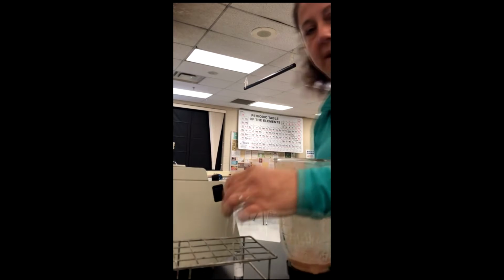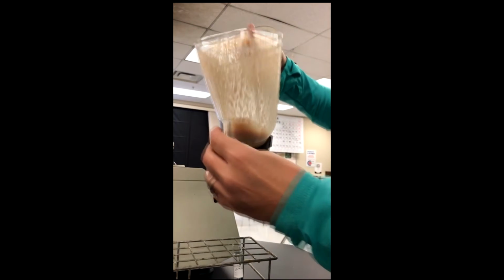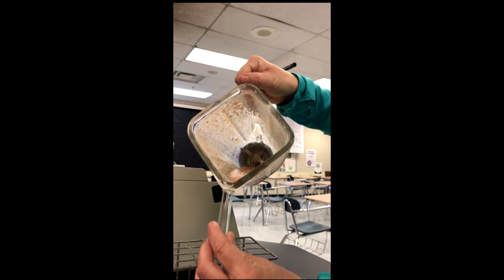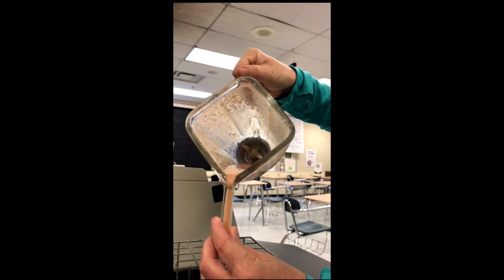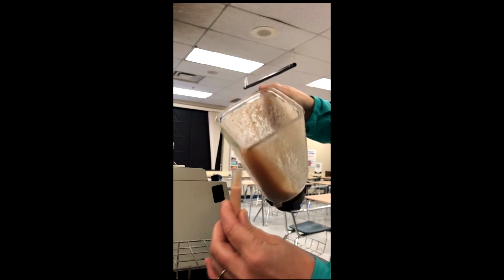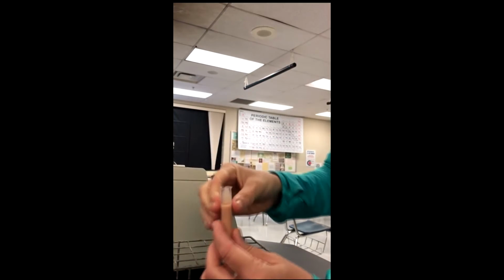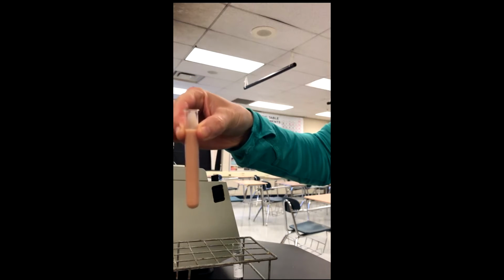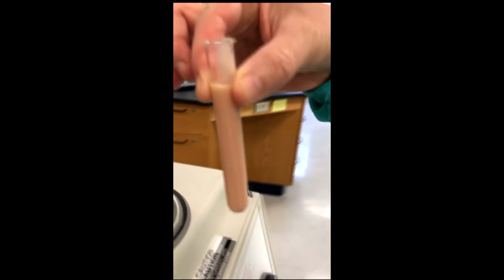I liquefied that hot dog for about 5 minutes in the blender. And so now I'm going to pour my hot dog slurry into a test tube, like so. And then I'm going to put the liquefied slurry down into a centrifuge.